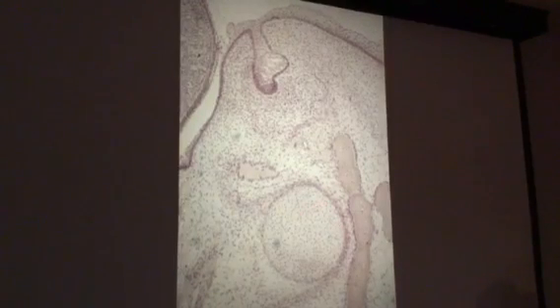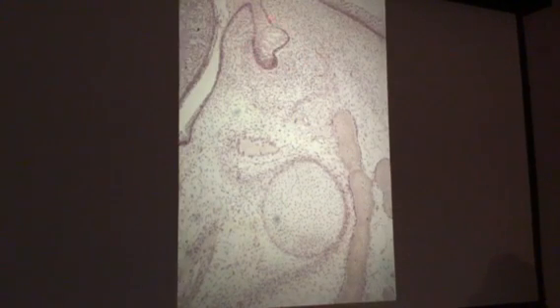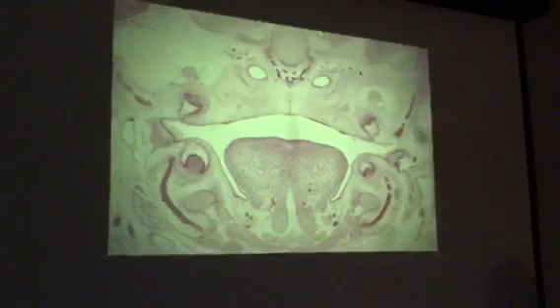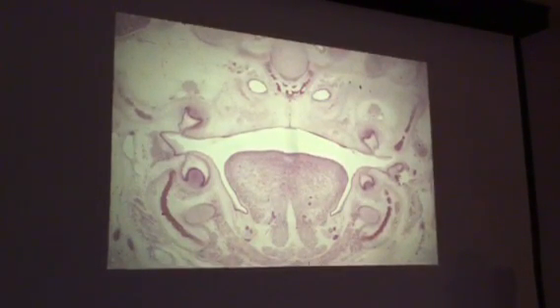Okay, and right there is Meckel's cartilage, and right there we have, well, it's not really a bud because we have that little depression, so that would make this cap stage. And how about that line of cells we see right there? Osteoblasts. Osteoclasts are also fair game. Okay, well that one we've looked at already.